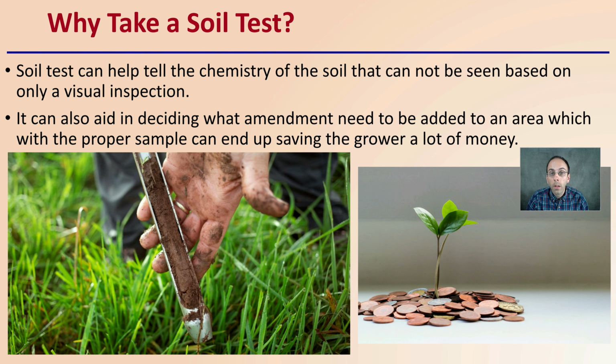So how to ensure a good sample? Well, the goal is to get a field representative sample. This is accomplished by collecting many subsamples that are put together to create an average sample. You don't just want to sample from one area and send that off to the lab. You want to get a collection of samples. Do not sample only from that one area, as simply put, this will not produce results representative of the field, as it will only provide information about a point in that whole field area. Many occurrences can lead to non-representative results.